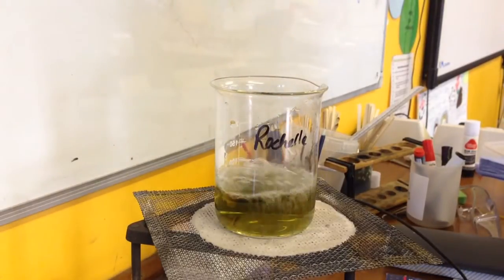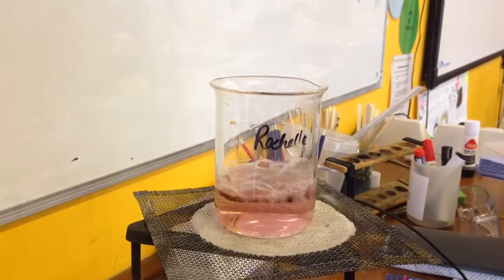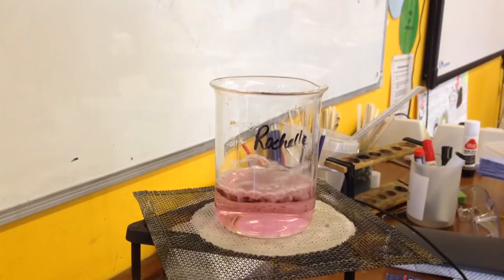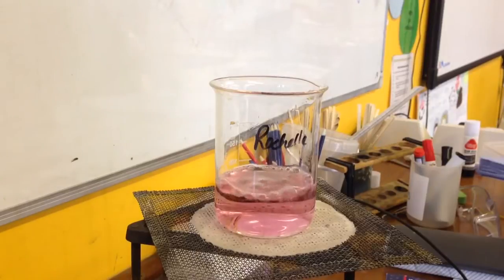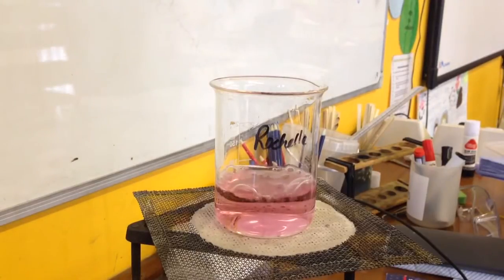This isn't because it's being heated, this is because of the catalyst making the reaction happen faster. You can see it's now gone back to the pink because the reaction is pretty much over. Still a few bits of bubbling going on there. But the catalyst has been returned to its original state. So it's an example of a homogeneous catalyst.